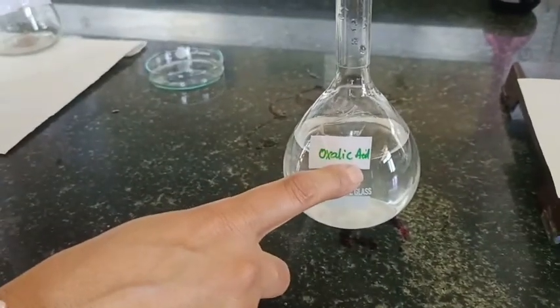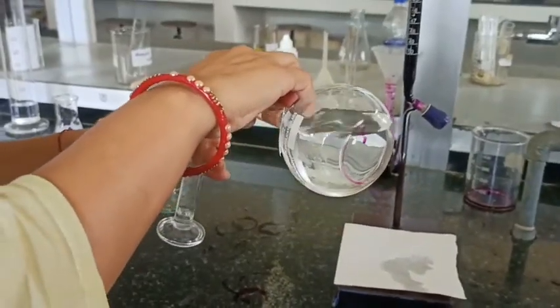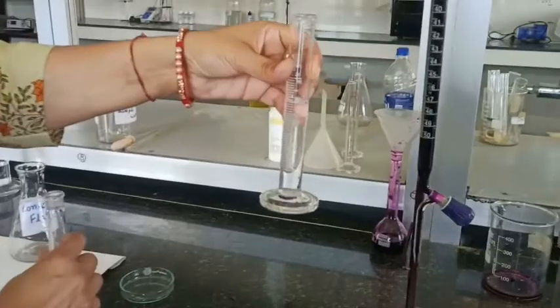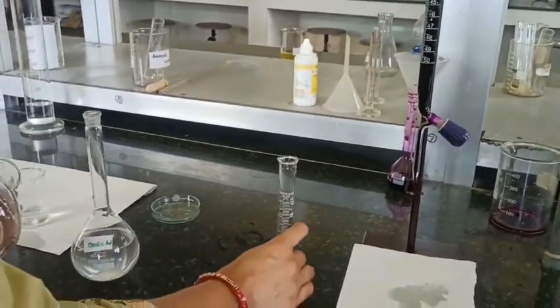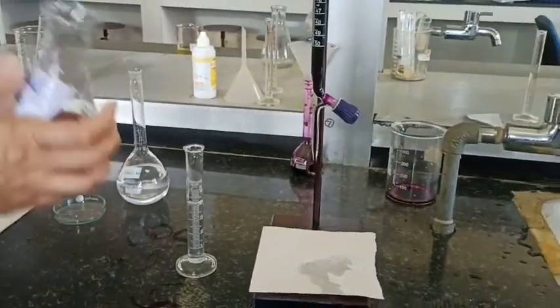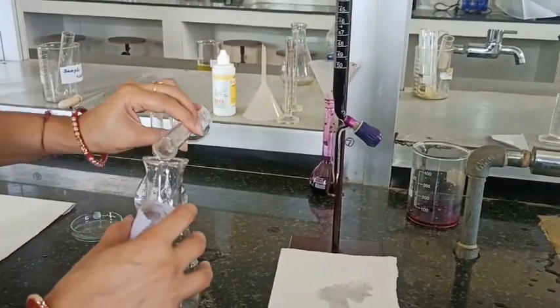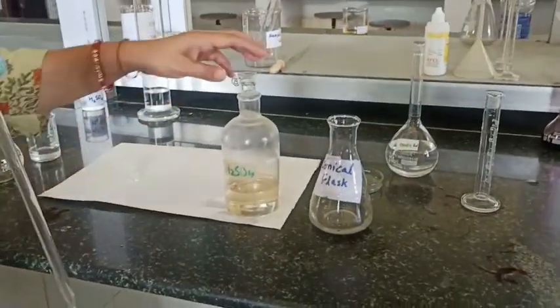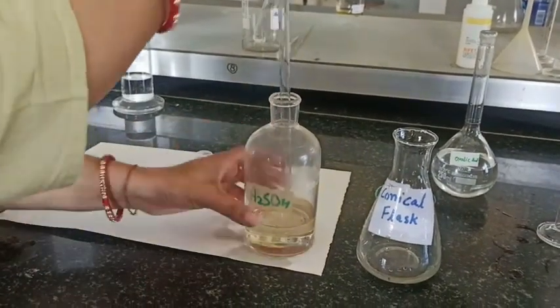Now we will take the oxalic acid. The acid is 0.2 molar. So I will take 20 ml of oxalic acid. I use the measuring cylinder just to show you. I do not use pipettes, but you can use pipettes here. That is more accurate actually. So now I am rinsing this conical flask with oxalic acid, which I am going to transfer to this conical flask. So this is 20 ml, and to this 20 ml, 1 ml of 4 normal H2SO4.